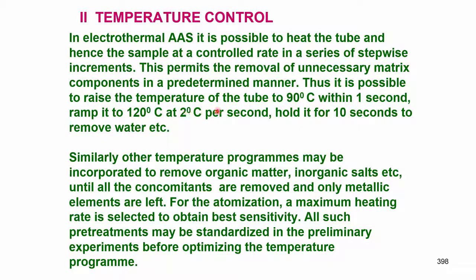So, it is possible, suppose you heat it to 100 degree centigrade or 90 degree centigrade within 1 second, that means heating time is 1 second, temperature is reached at 90 degree centigrade, and then you can hold it for 1 second, 2 seconds, 3 seconds like that, because you are handling microliter quantities of the sample here.